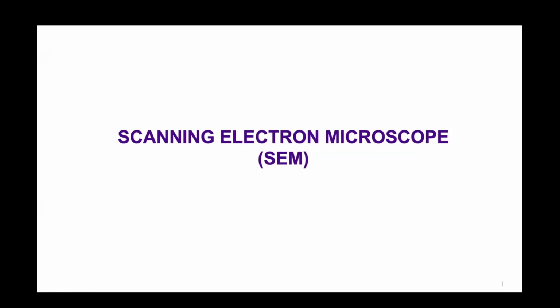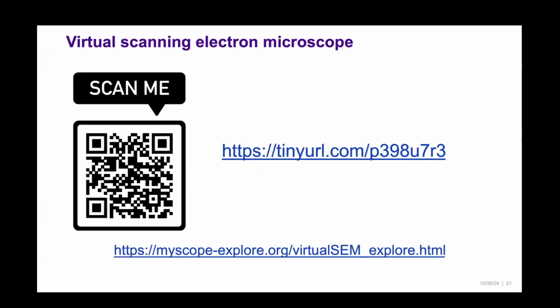Now the fun part starts. You are going to use your laptop or mobile. I recommend a laptop. What I have given here is a virtual scanning electron microscope. I will also do that, and in case you have a problem, you can use this URL if you are using a laptop. You can also scan and get the URL. All this leads to the same web page. It's a virtual simulator, and I will also go through that.